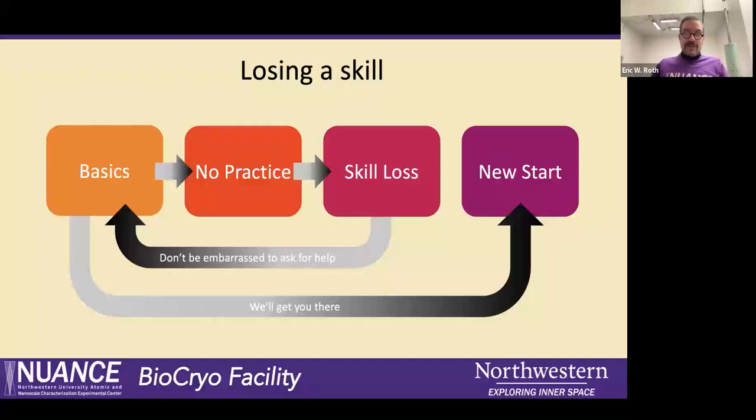So, please, we don't want you struggling. Come ask us for help. We'll get you started on relearning any skills that you've lost. Training is an ongoing process. We're not going to charge you more if you forgot how to align an aperture or something.